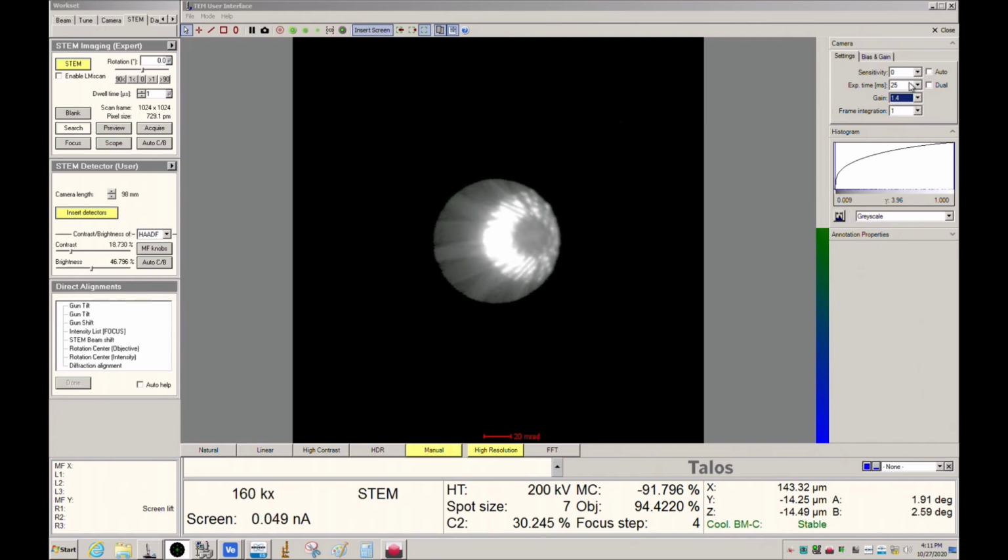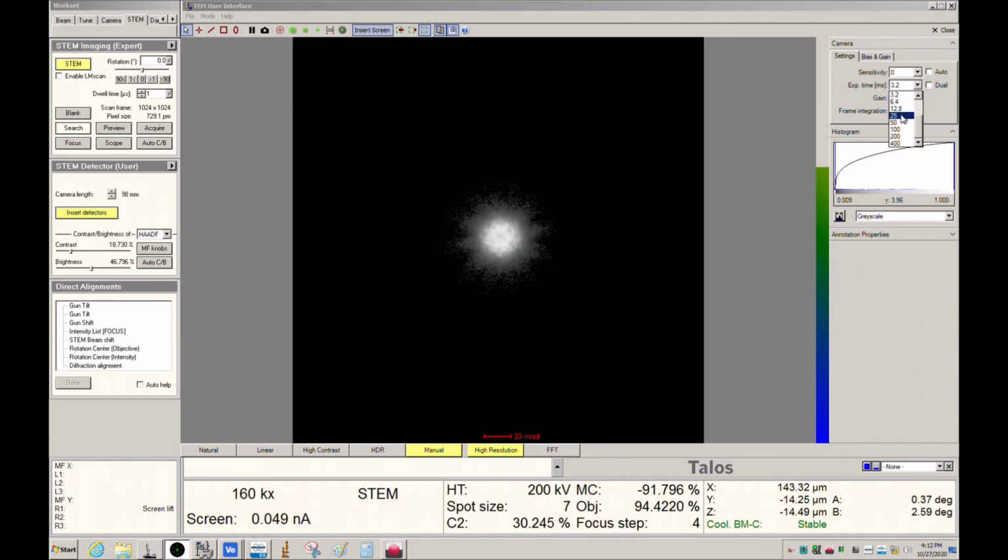The only difference now is that I have a convergent beam, so I have a CBED pattern rather than focused spots. Okay, so basically the map that I generate by working in STEM mode is no different than the map I generated in conventional mode. So you can see here now I've gone too far negative with alpha, and my rings are curving to the left, so that means I have to adjust alpha positive. Okay, this is just like, again, the same thing that we found when we generated the map in conventional mode.